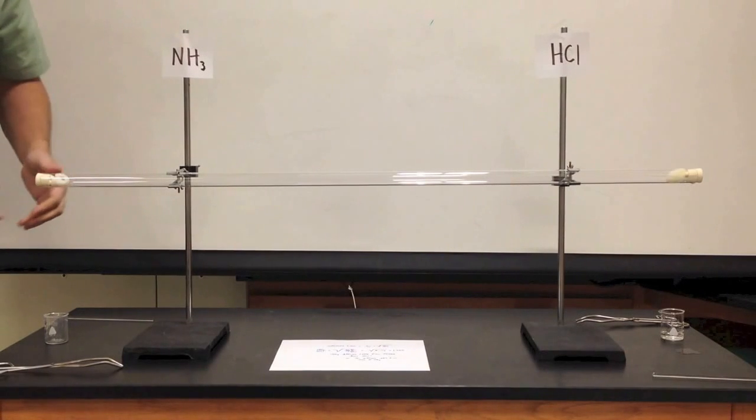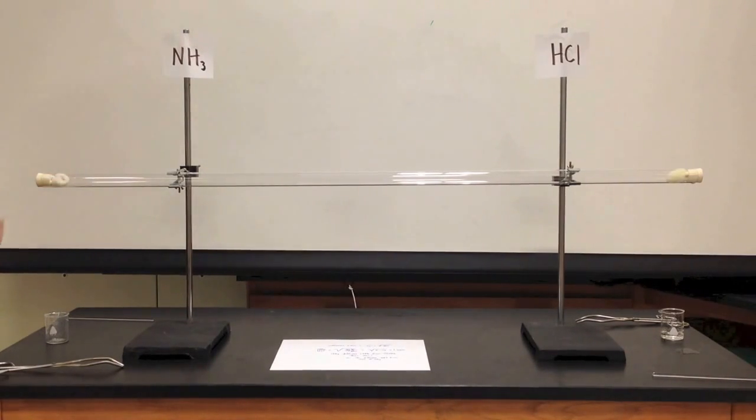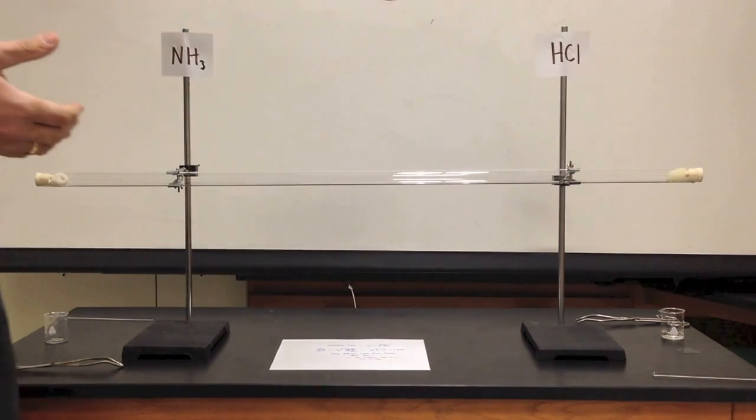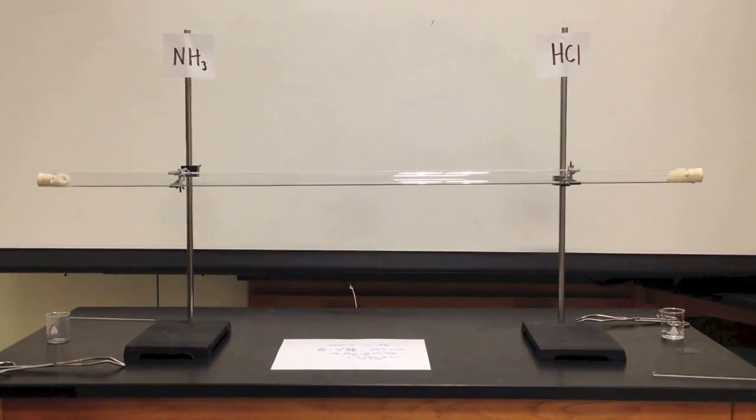Now, where these gases meet should give me an idea about the relative rates of diffusion. Ammonia being approximately 17 grams per mole, and hydrochloric acid being approximately 36 grams per mole, should tell me the ammonia is lighter.